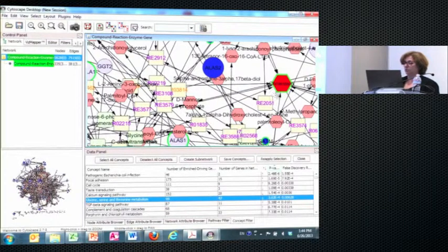And so this is cholesterol. But notice something else. That something else is this bright green border around it. What it means is that it was significant, okay? It passed the threshold that we set. If it wouldn't be significant, then it would not have that green border, okay?